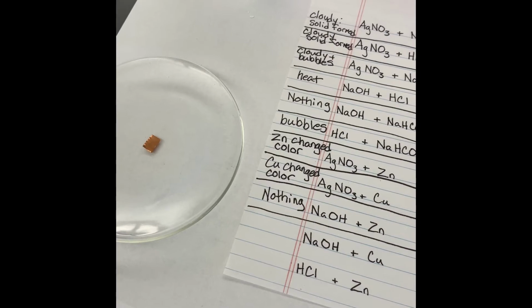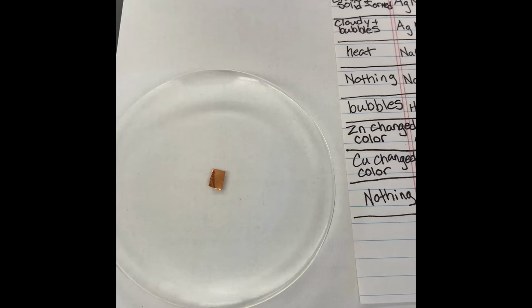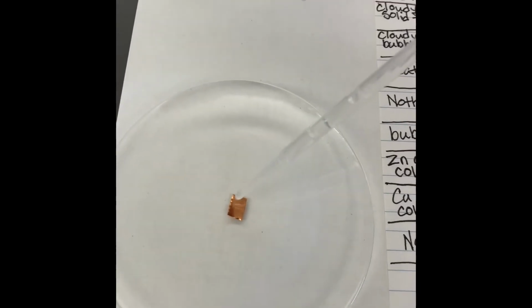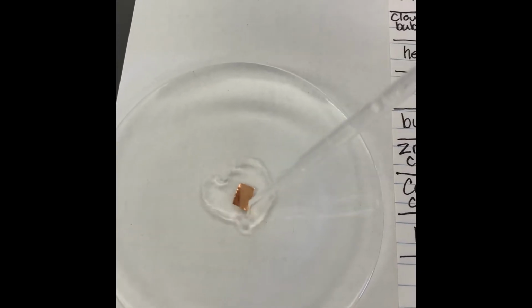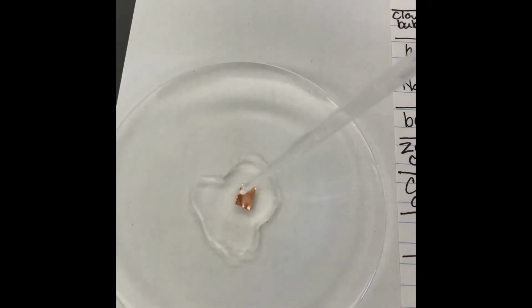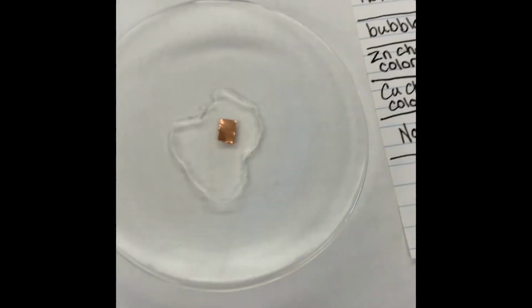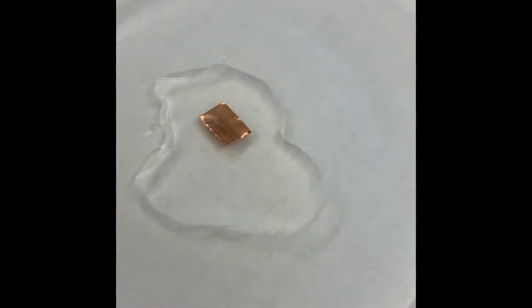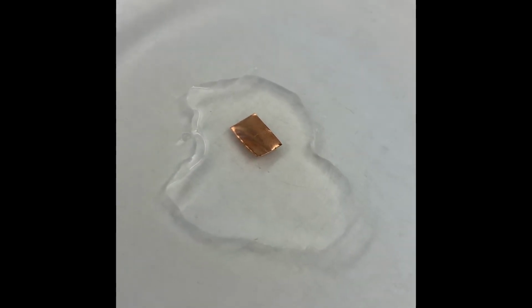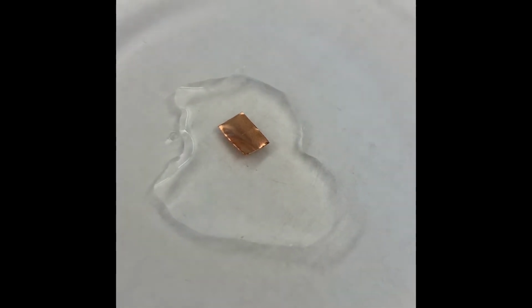Now let's look at sodium hydroxide and copper foil. Right, so far not seeing too much.